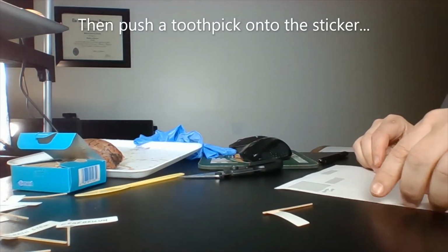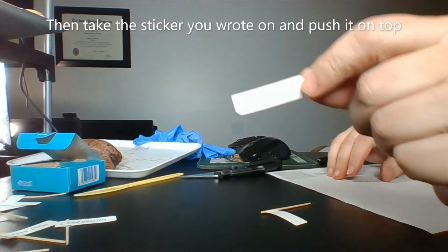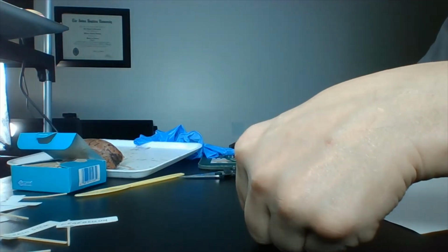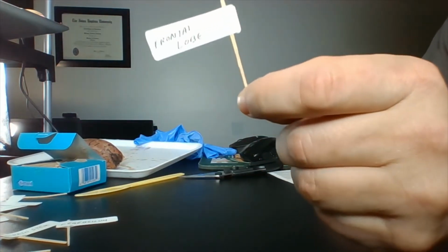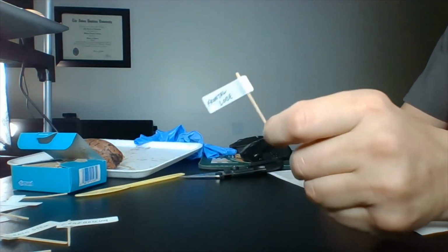Then take the sticker that you wrote on, put yours up on there, and then push it onto the other sticky side. So you want the two sticky sides going together to make your flag, and it says frontal lobe on it. And there you go.